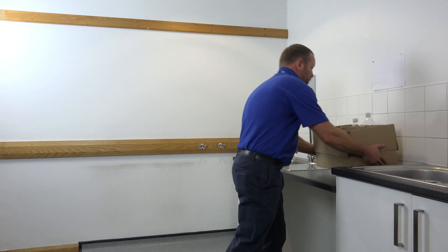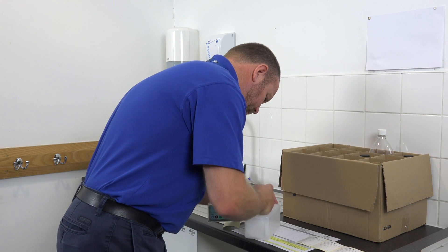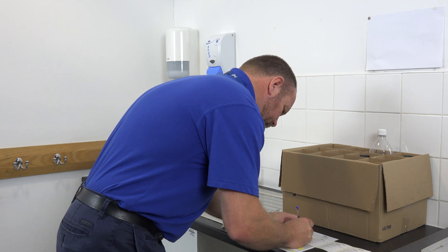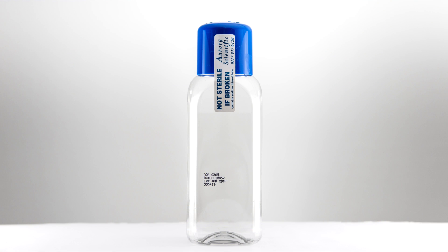Because deviating samples are generally not acceptable for regulatory purposes, resampling is recommended wherever possible. But of course, these headaches can be avoided completely by always using the correct bottles and following the filling instructions exactly. Your laboratory will be happy to advise you on how to store your bottle stocks before use, and they will highlight any bottles that may require stock management to ensure that your use-by dates are complied with.